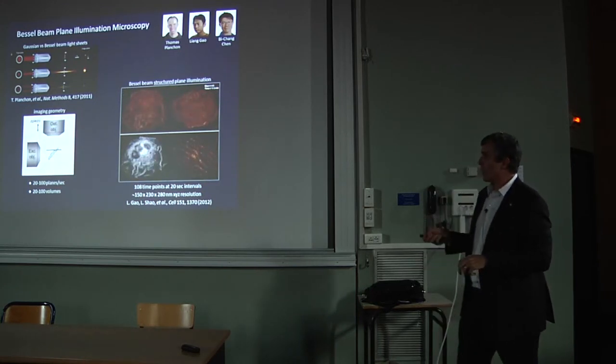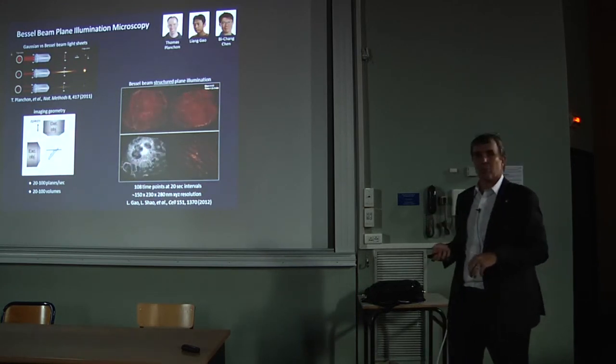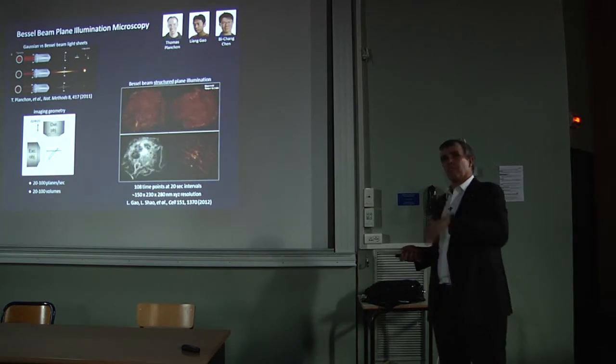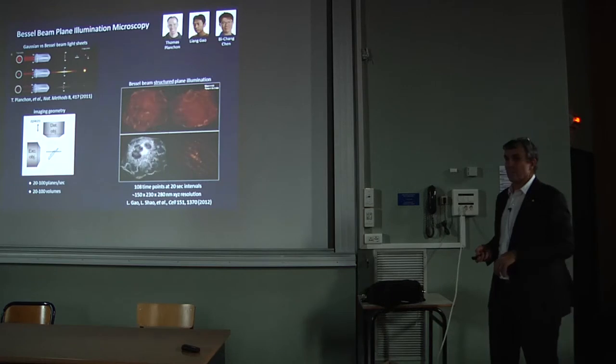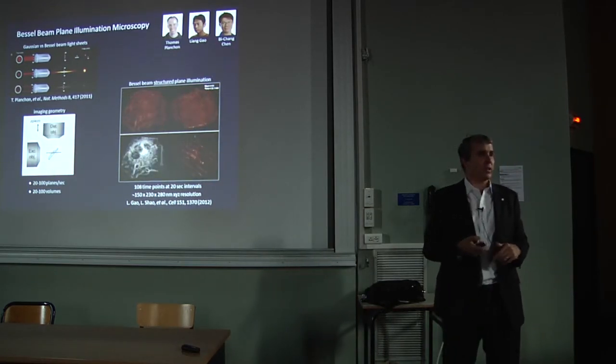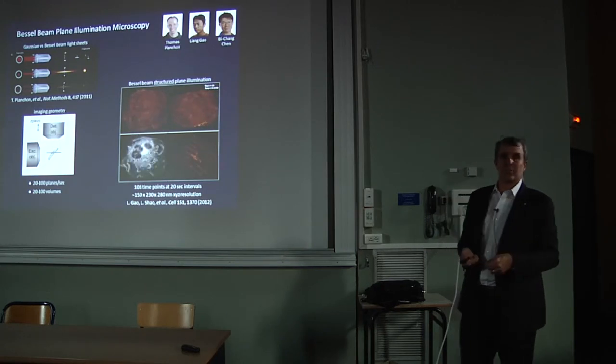And so now it's a pencil of light that you sweep in and out of the screen while you integrate on the camera. Then you step to the next plane and the next, and you generate your image. That sounds like it might be slow, but in our current microscopes, we go up to 1,000 planes a second, or several volumes a second.